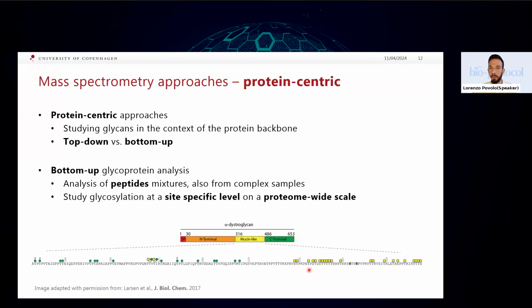So for this, there is no simple answer, but I would recommend getting some inspiration from other papers, from what other people did. And importantly, another thing that also helped me is to look at papers for other post-translational modifications. For example, phosphorylation. The concept is very similar. Of course, we are working with a very different modification, but the type of data is quite similar. So perhaps you could get some inspiration from phosphoproteomics data on how to present data. So I hope this was useful.